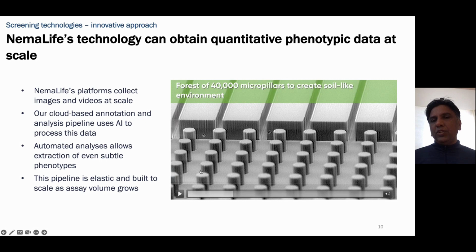The other key engineered feature are these blocks that you see, where the spacing is optimized to allow the eggs and progeny to be removed. However, the adults are still trapped in the chamber. So these blocks allow us to do all the filtration, if you will, of progeny during that reproductive phase I was discussing earlier.